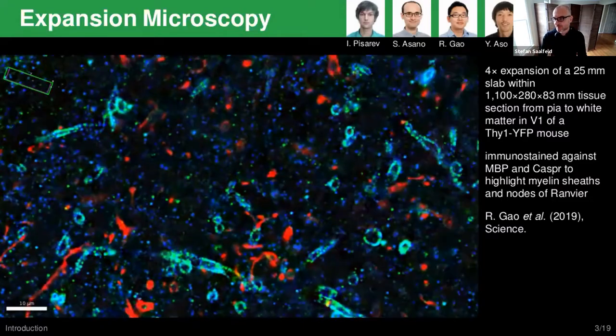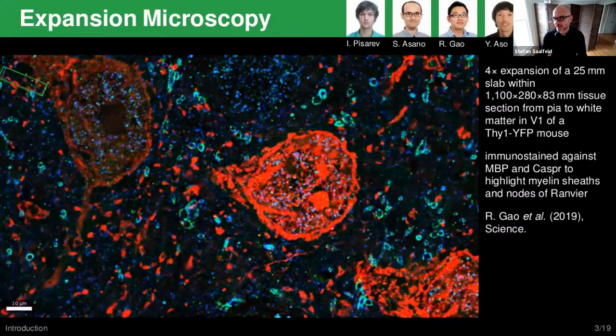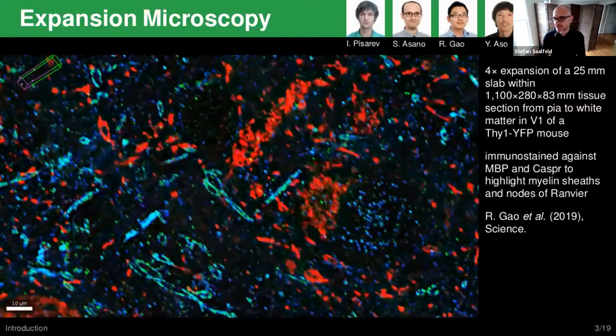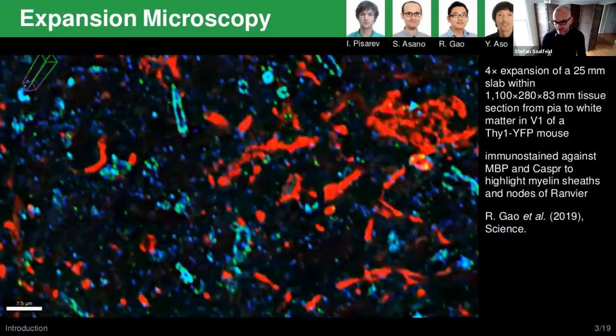This has been published before by Kevin Smith and colleagues, but was only implemented for 2D images that fit into main memory. Here we have like 10 to 30 terabytes of image data. We want to use all the pixels to estimate these flat fields. So this was the last video.